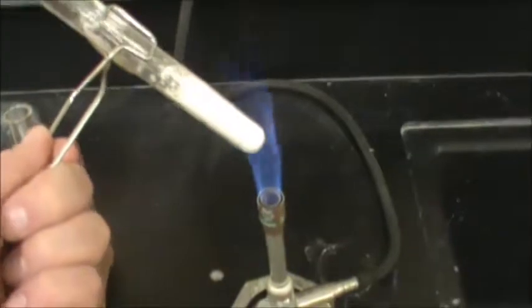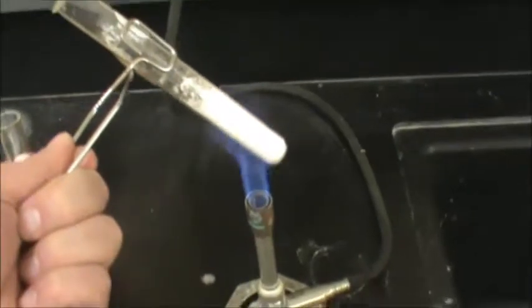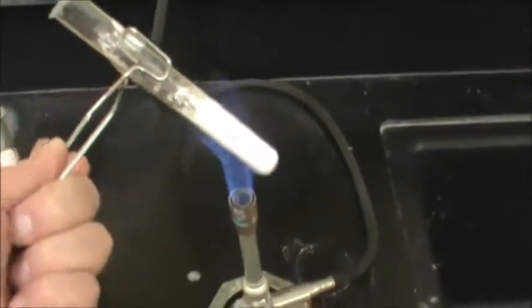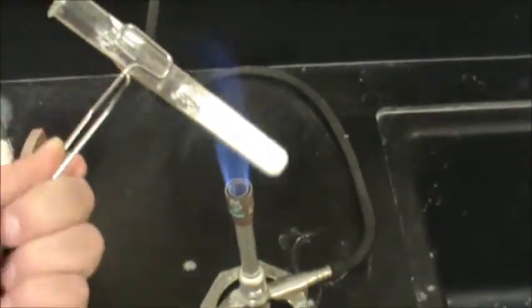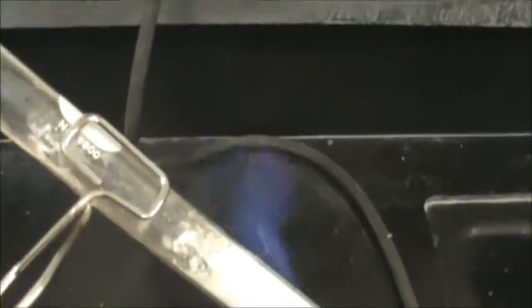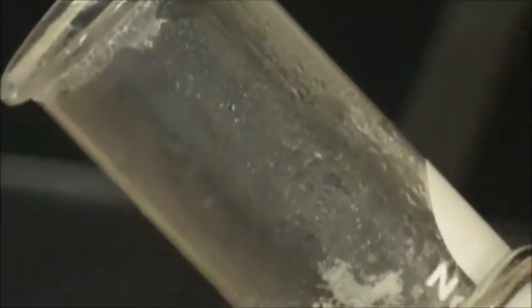Place in that flame and we're heating. We're going crazy. Look at it heat. Alrighty, so we're heating and heating and heating, and eventually what ends up happening, we get this so nice and hot that a reaction takes place. We start cooking this stuff. If you can see it, you might start to see some water vapor showing on that test tube. You might see some little droplets. That's what you're seeing right there, little droplets of water starting to accumulate, especially at the end of the test tube. You see that? That's nice. So we're definitely seeing some water, but there's also a gas that we cannot see.